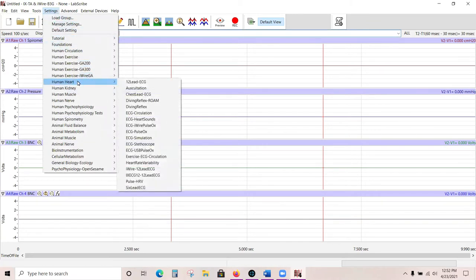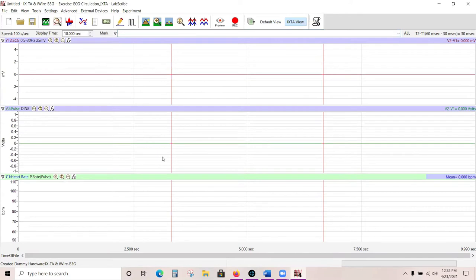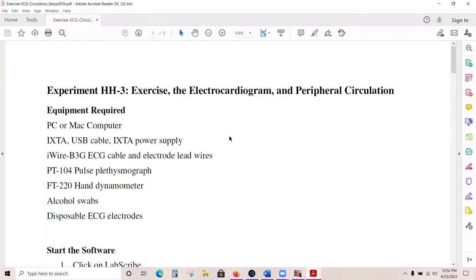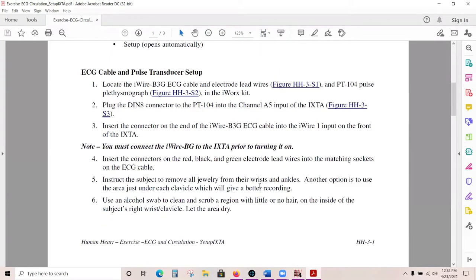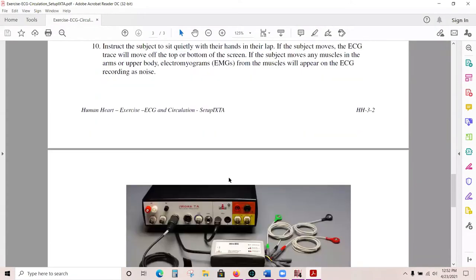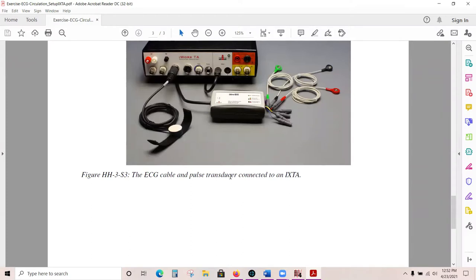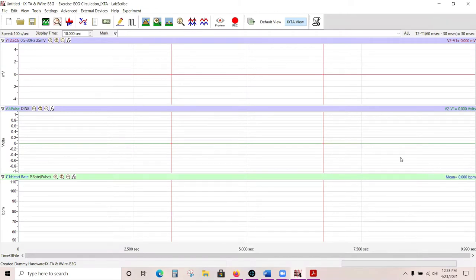I generally like to show everybody how to do an ECG, so I'm going to go to Human Heart and then Exercise ECG Circulation. Once that is chosen, a couple of different things are going to happen. One of the first things is that you will get a PDF of a set of directions showing how to connect everything together. The other thing that happens is the screen will change—so now rather than having four random graphs, you have graphs specific to recording ECG, pulse, and heart rate.